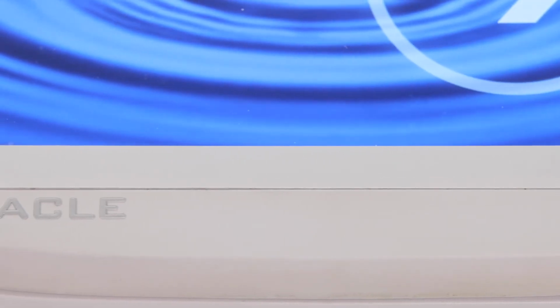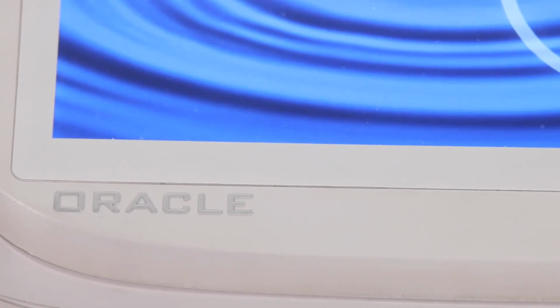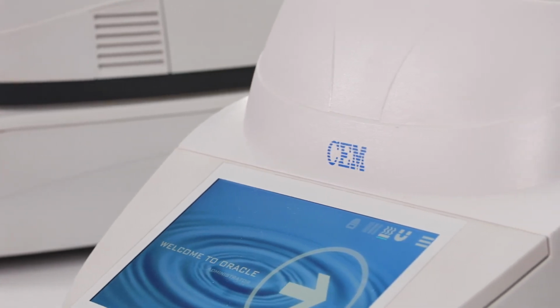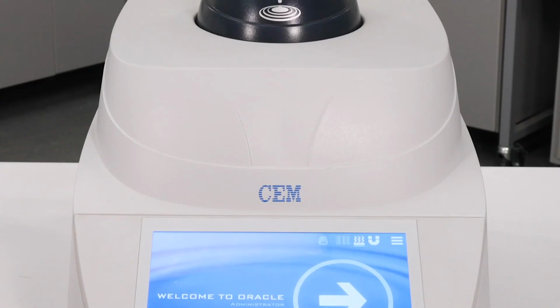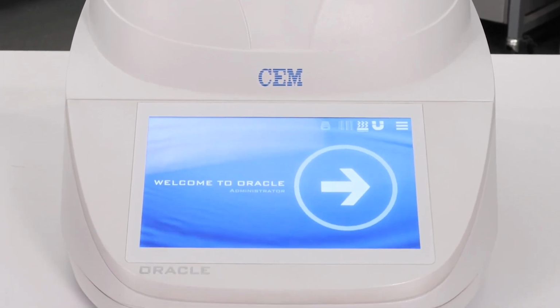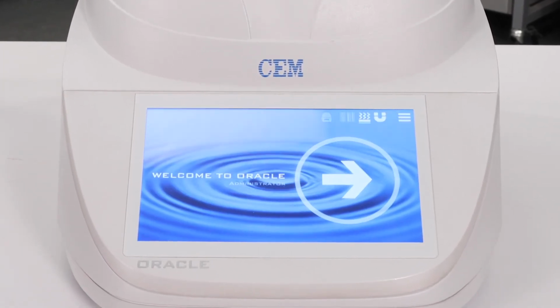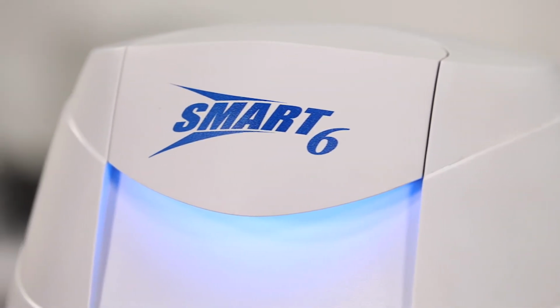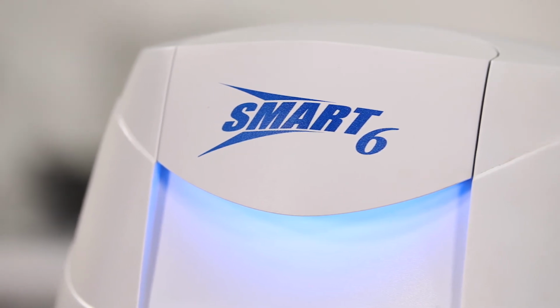Now that we've taken a look at the technology behind the ORACLE, let me show you how easy it is to run a sample. In order for the ORACLE to achieve calibration-free analysis, two things must be accounted for. The sample must be free of excess moisture, and the sample must reach a constant temperature. That can be achieved with an air oven for high throughput applications or with a Smart 6, which enables rapid results in 3 to 4 minutes.